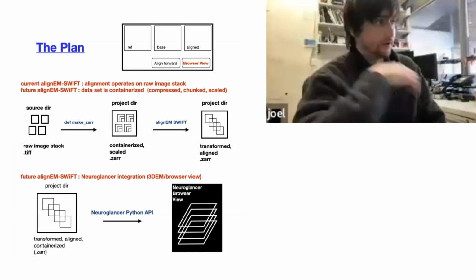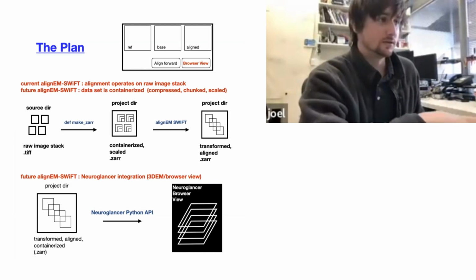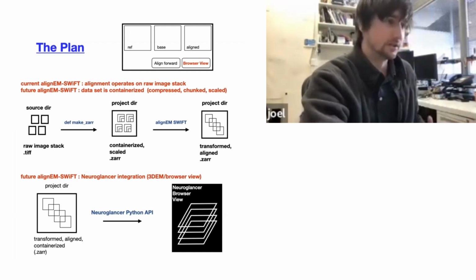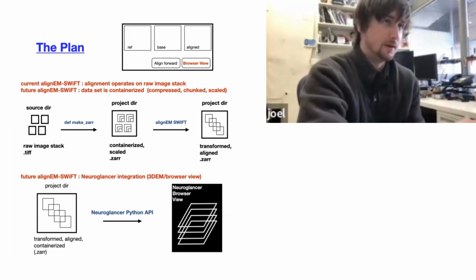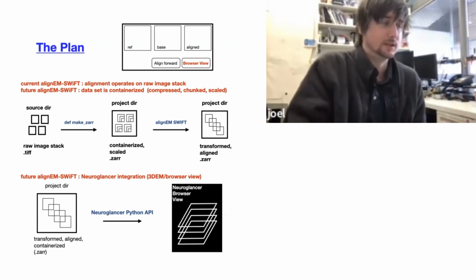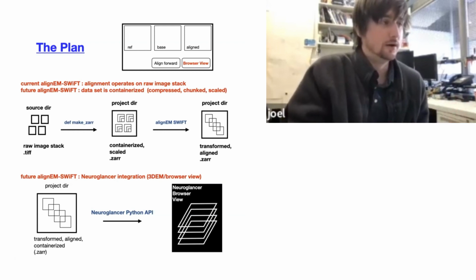I think at first it wasn't totally clear if this was going to be more an extension of the existing graphical interface or a web-based thing. And I think as time has gone on, we see that we really want to just have a web-based technology that maybe is completely divorced from the existing graphical interface. Just talking about the alignment tool right now.